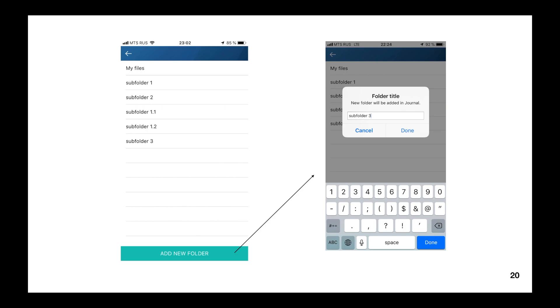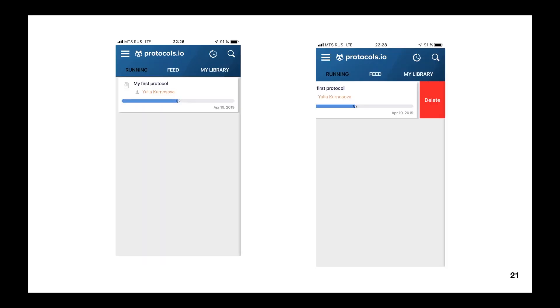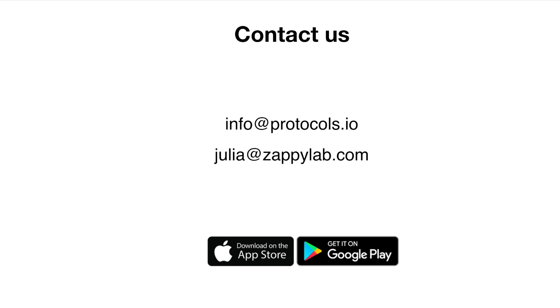After saving, your experiment will be synchronized with all devices and will appear in the Running tab and in the corresponding folder. The Running tab contains all experiments ordered by identification date — they are not separated by folders, so you can see all your experiments in one place. If you need to delete an already saved experiment, just swipe it. We also have an Android application, so feel free to download it via Google Play, or find us in the App Store if you use iOS.